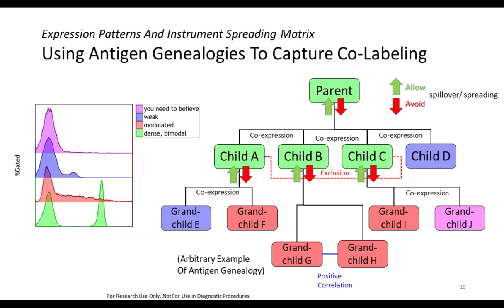That makes it really clear. I really like this graphical representation, and it really helps when understanding the principle for what you can allow to spill over and what is to be avoided. And so when moving up the tree, spillover is allowed, and moving down the tree in levels of the hierarchy, avoid spillover. I think that is a very crisp way of saying it. Just thinking of this going down and going up principle and how this is corresponding to the spillover spreading allowance or avoidance rules. Mm-hmm.